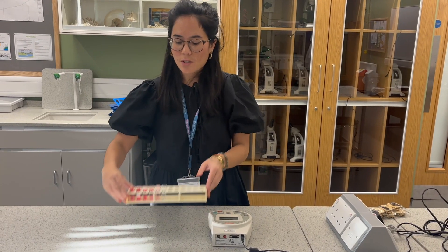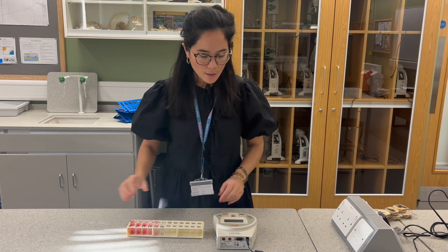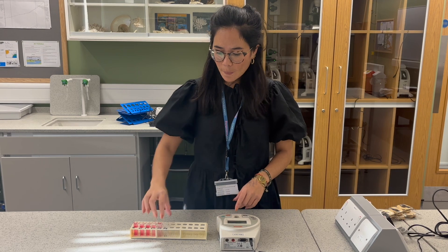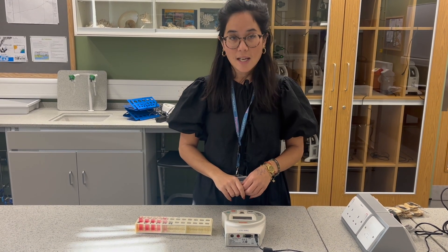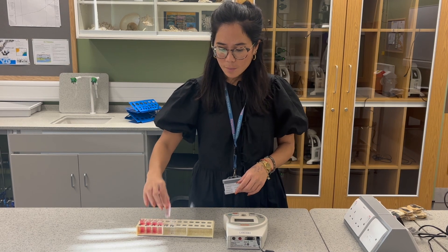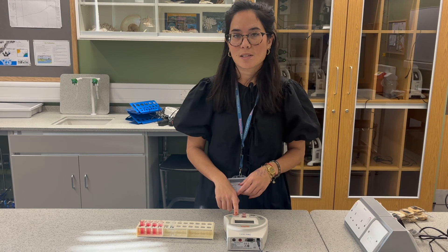I've placed my various solutions in the cuvette. It's now time to calibrate the colorimeter. Because the solutions are pink we need to add a blue filter. I've got a cuvette filled with distilled water and I'm just going to press the R in order to calibrate the colorimeter. That now means we're ready to test our samples, placing them back into the slot but this time pressing the test button.